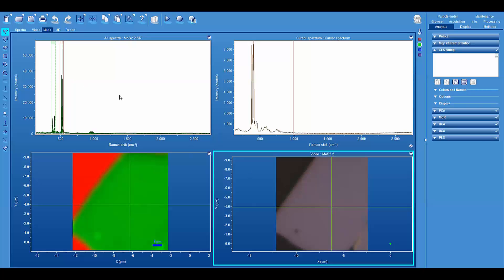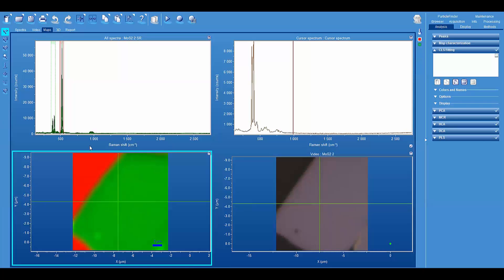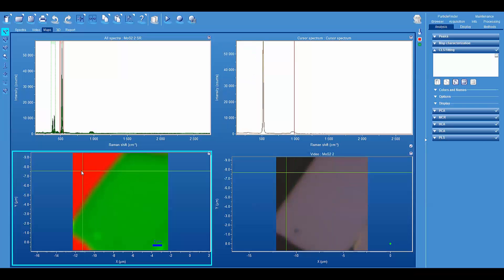In the upper left hand corner, you see the entire hyperspectral data set of spectra collected over this 10 micrometer by 10 micrometer area in 300 nanometer increments. And in the lower left hand corner, you see the Raman image of this particular sample generated by the red and green brackets, where the red bracket is surrounding the single Raman peak of silicon. And the green bracket is surrounding two of the peaks of the molybdenum disulfide, these two here that you see. And the spectrum in the upper right hand corner is the so-called cursor spectrum. That is to say that spectrum corresponds to the spectrum associated with the location of the crosshairs in either of the images below.